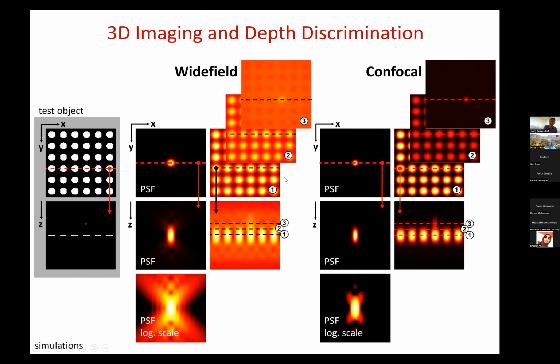You kind of see the same thing. But when you move out of the plane, suddenly the light disappears. And while this is weak here, it stands clearly apart here. You can see it here a little bit better. This extra object here stands clearly apart from the background now. It was much harder to detect with a wide field microscope.